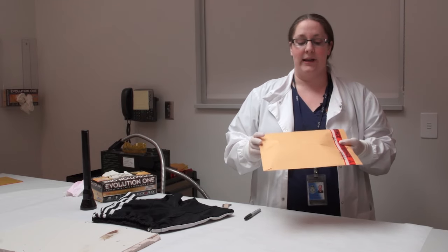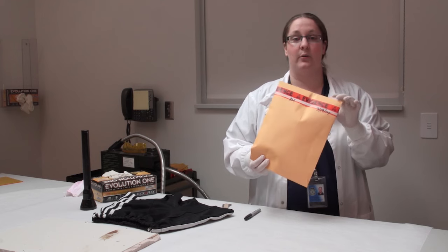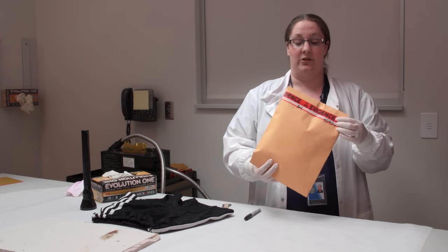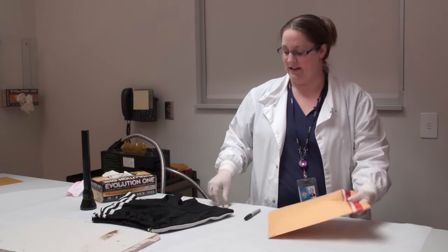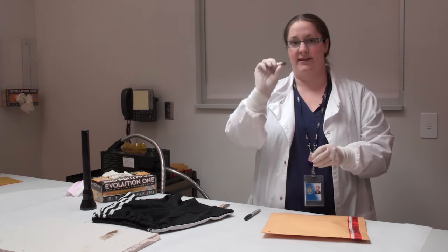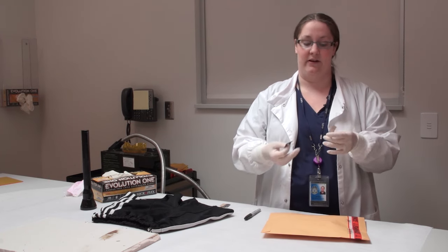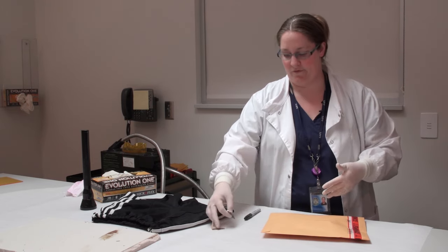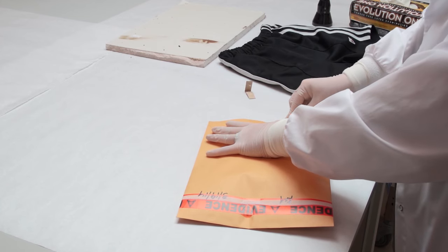It's really important that when I get into this, I do not want to break this seal either, so I can leave it intact. When this case goes to court, the officer that collected it can say yes, that is my seal and it hasn't been tampered with. So I'll open this piece of evidence in another location. We have disposable razors here so we're never using the same object again on a piece of evidence - that prevents contamination from one piece of evidence to another.